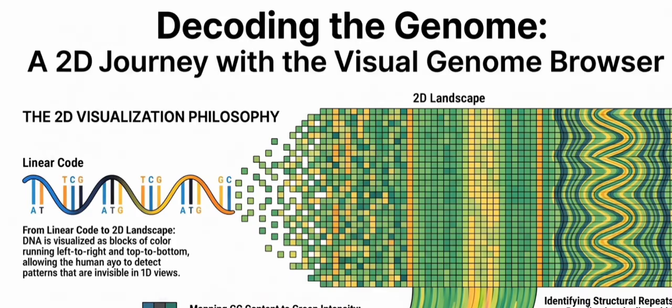Makes sense. So an open reading frame is a stretch of DNA that has a valid start signal, a valid stop signal, and a continuous sequence in between that isn't interrupted by random premature stop signals. So it's a stretch of code that could theoretically be translated into a functional protein. Exactly, and the P marker tests for that instantly. Instead of having to cross-reference an external database or load a heavy annotation file, you just drop the pin. The software immediately analyzes the raw code starting at that exact base pair and tells you if a valid protein could physically exist there. It is a rapid-fire test for biological potential.